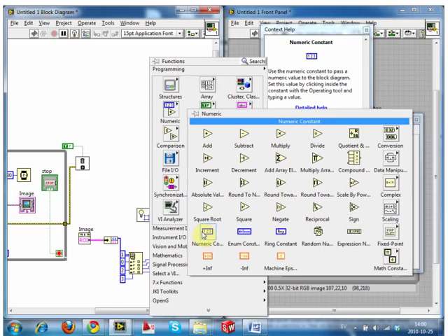And you then have to index the array. So you're saying, I need to pull out these numbers individually from this one string array. What this is doing is saying, look for the number before the first comma. And then the second one, which is position 1, is saying look for the number before the second comma. So 0 means look for the first element, and 1 means look for the second element. It's basically taking numbers, putting them into something which defines an array, but then you need to get each number out. So it's called indexing the array, meaning I need to pull them out.